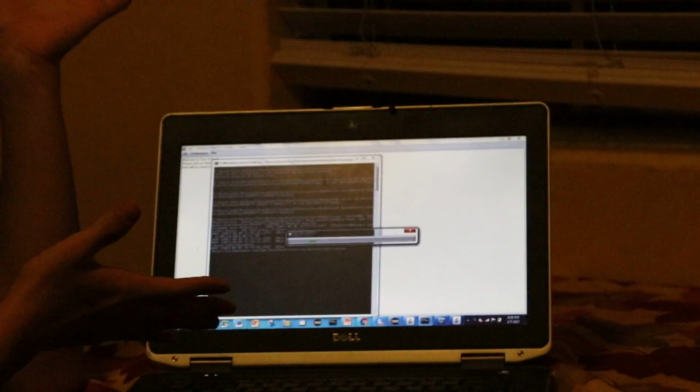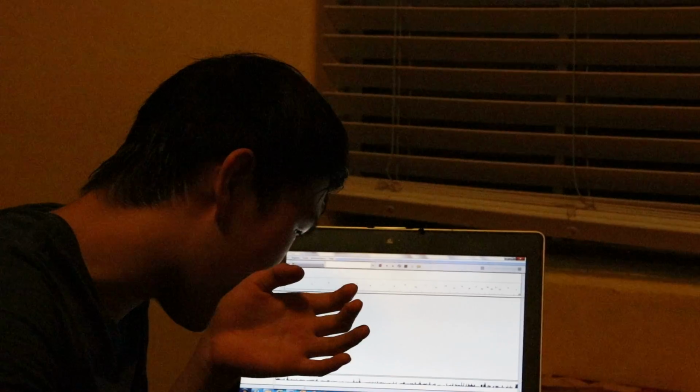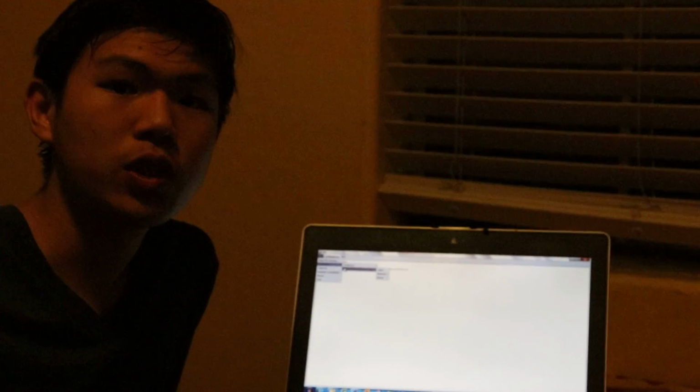That accomplishes the goal right there by, as you can see, opening up the IGV directly from the GUI that I created. So now we have our IGV all set up. The server is connected to my program. So next, we go back to our program, and we want to load our text files or our binary alignment maps, which contain the patient's DNA. So let's first add our patient's DNA.